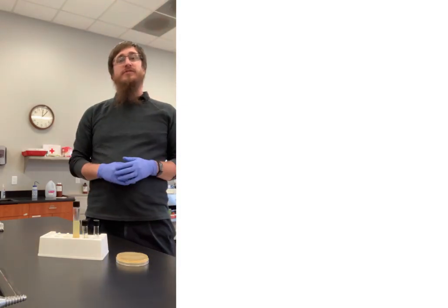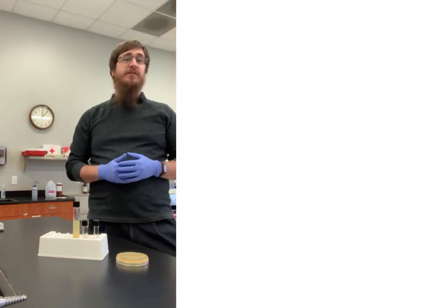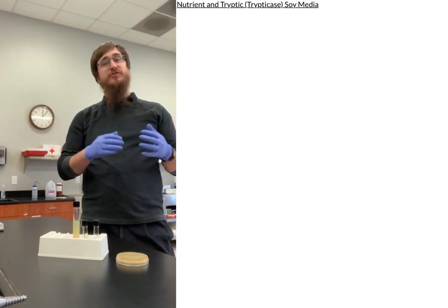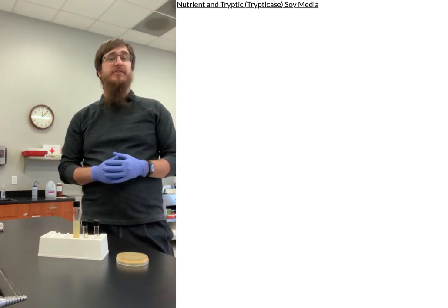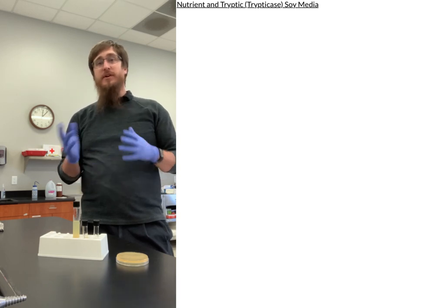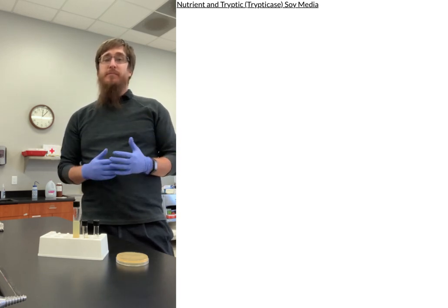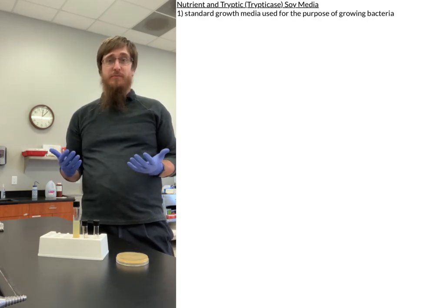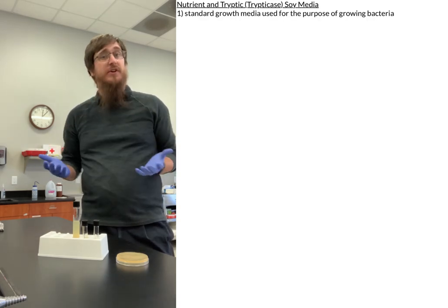Hey everybody! Today we're going to be talking about the nutrient medium and our Trypticase or Tryptic soy medium that we're going to be using in class. And really, when it comes to these two types of media, basically these are standard growth media that we use with the basic purpose of growing stuff.